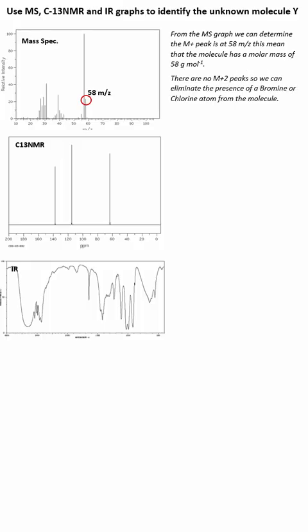However, what we do know is that we cannot see any M+2 peaks to go with that M+ peak, that is, two peaks that are 2 units apart to the right with a ratio of 1:1 if it was bromine isotopes, or 3:1 if it was chlorine isotopes. Those are absent, so we can definitively say there's no chlorine or bromine in this molecule.